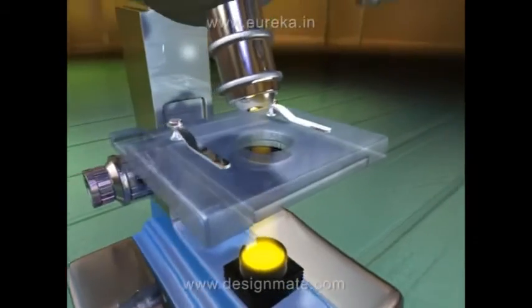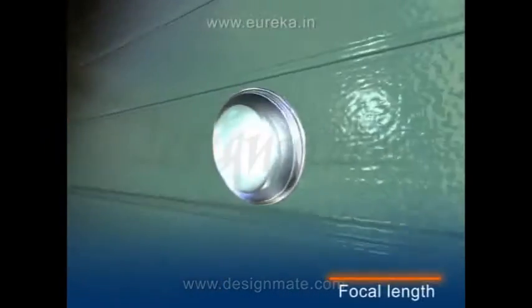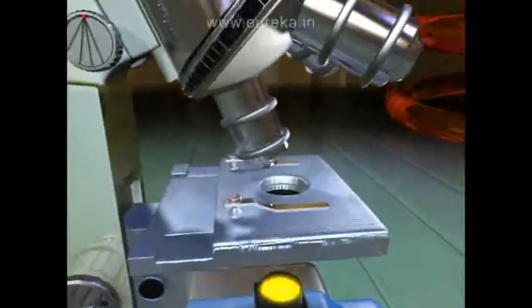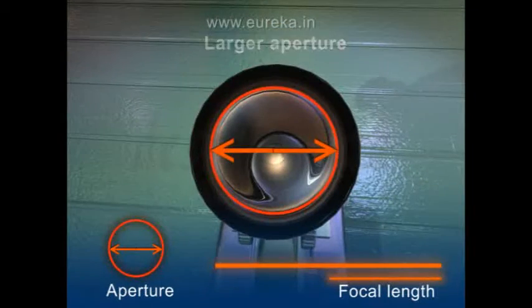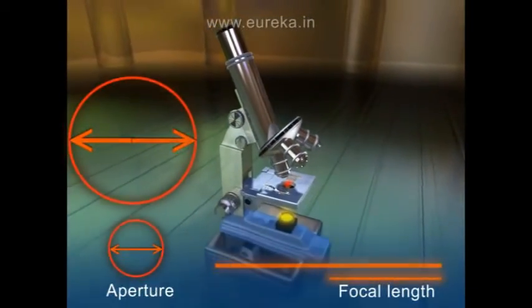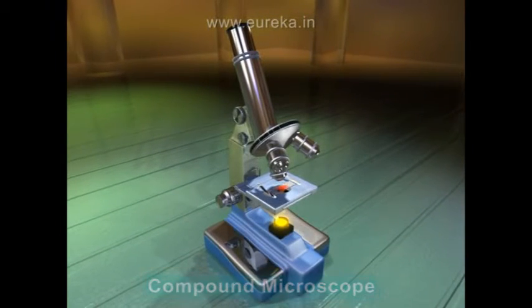In its simplest form, the compound microscope would have a single glass lens of short focal length and small aperture for the objective, and another single glass lens of comparatively larger focal length and larger aperture for the eyepiece or the ocular. Next, let us see how all these parts work together to give us the final image.